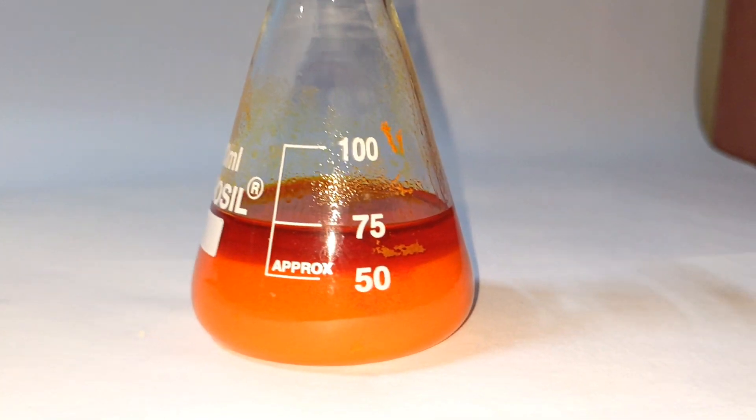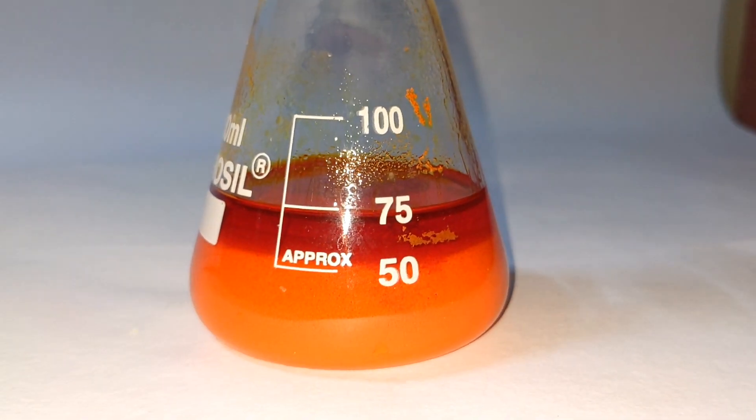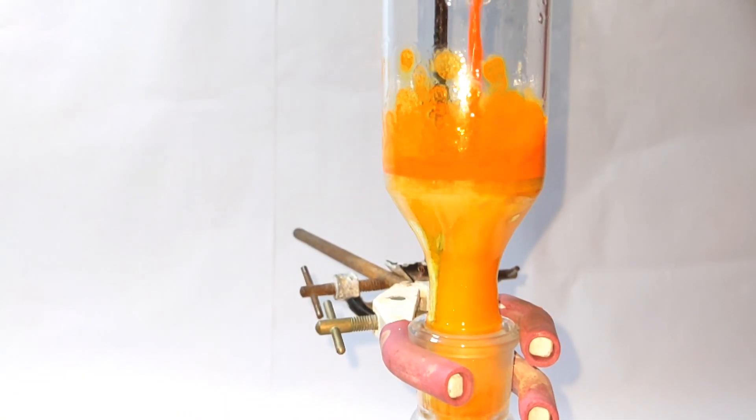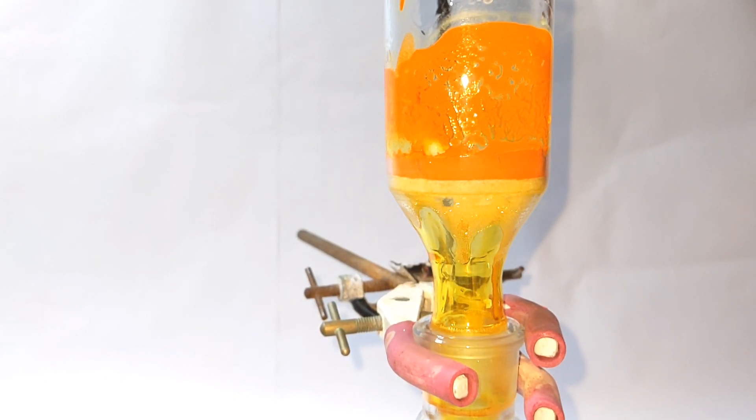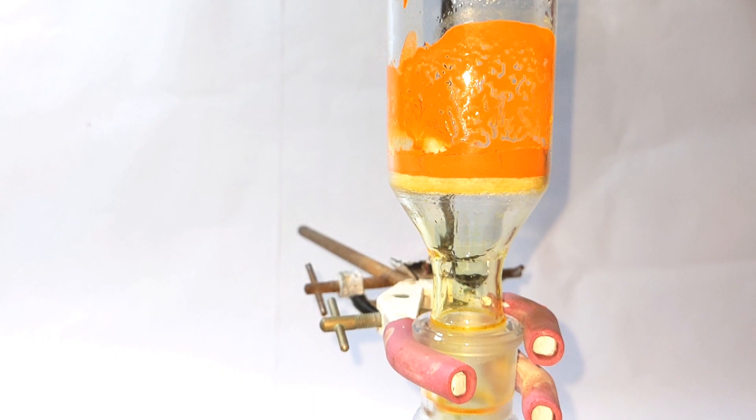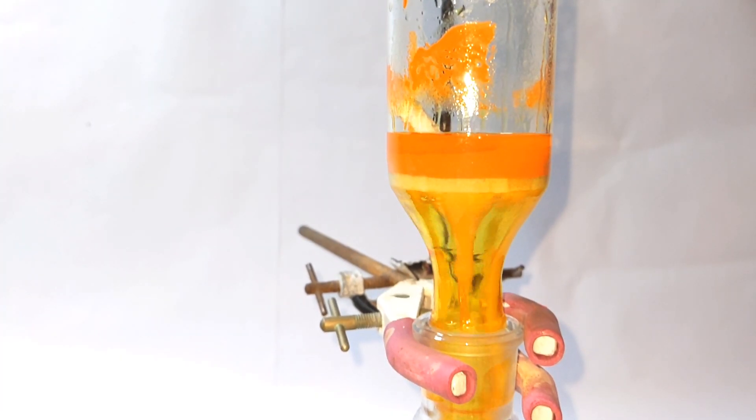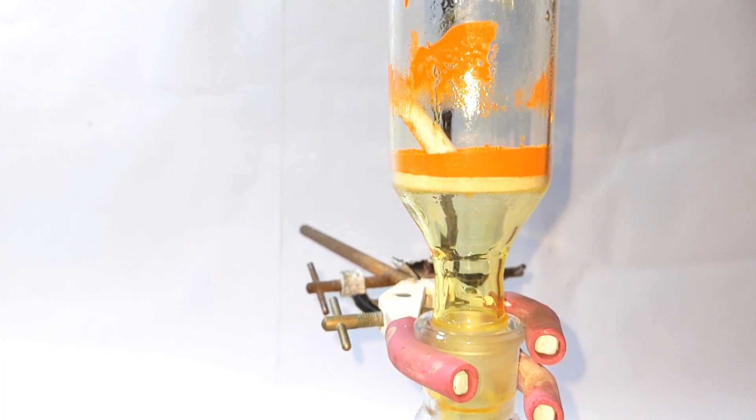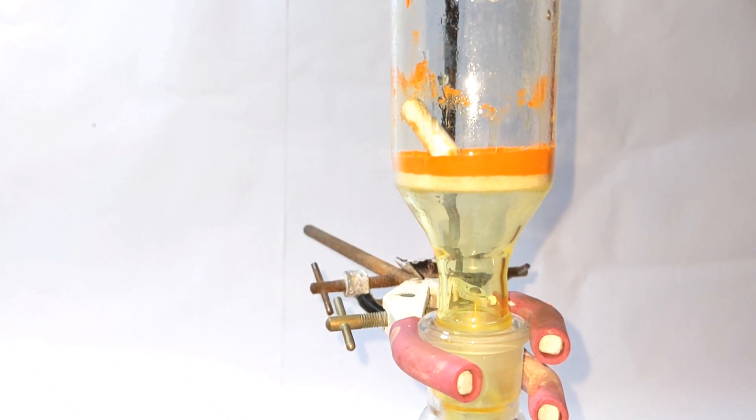After 15 minutes the flask was taken out and cooled to room temperature. You can see the product settling down to the bottom of the flask. Now use a vacuum filtration method to collect the crude crystals. Then the crude product was washed a couple of times with ice cold distilled water ethanol mixture, one to one mixture, and then the vacuum was kept on so that the product dries up.